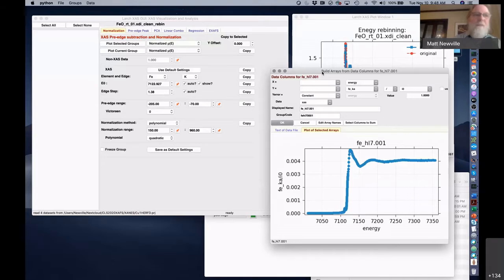So there can be effects, often called pinhole or reduced absorption effects, that affect the transmission XAFS as much as the fluorescence XAFS. In fact, the data I have up here, I was just starting to read in, is fluorescence XAFS, and it's a little suppressed due to overabsorption. And we'll get to that, and I was going to show partly how to work with that. But for transmission XAFS, there are distortions that can happen too.